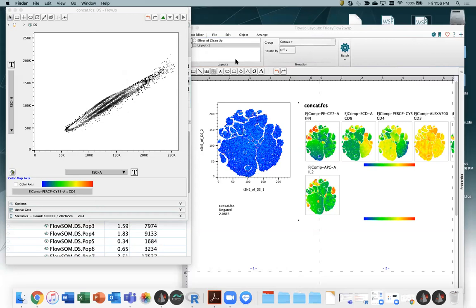So sorry for not being able to say that there's an exact number of RAM that you should have and an exact number of cores that are the absolute right number. It's definitely a relative scale based on the amount of data you have and the amount of money that you're willing to spend. So I hope that's a good enough answer. Sound okay? Yes, thank you.